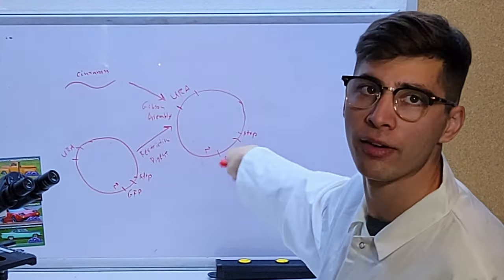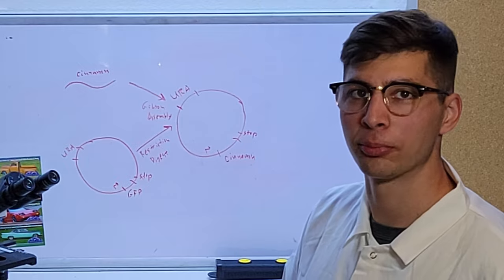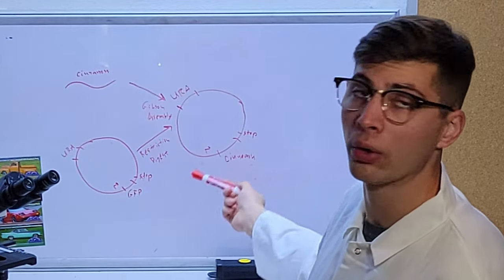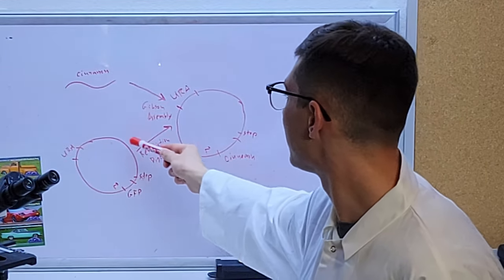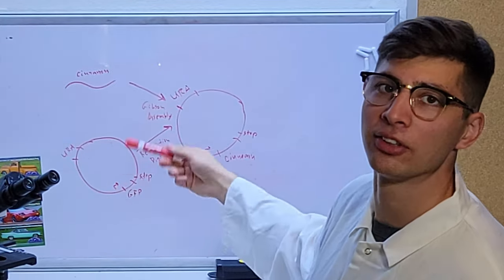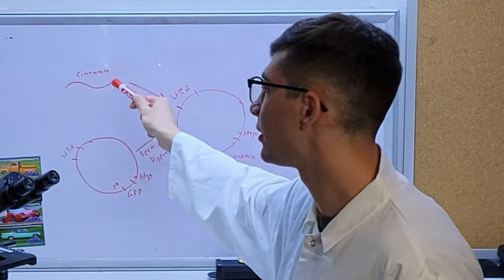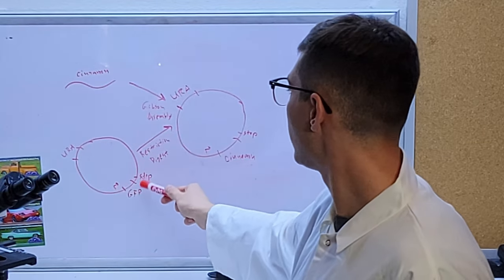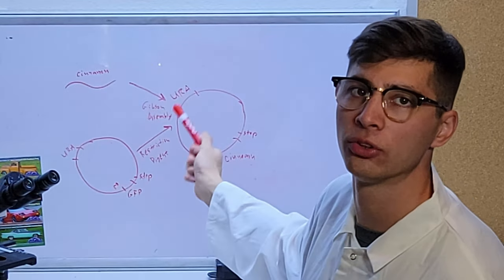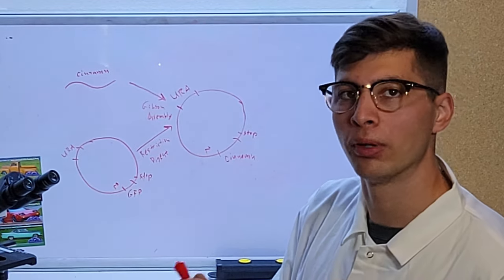On the other side, we should have our finished plasmid. We've only used two of the four tools that I mentioned previously. We could have used PCR to amplify the cinnamon gene from another organism, or to amplify the entire backbone of the plasmid excluding the GFP gene. We could have also used ligation — designed the cinnamon gene to have restriction sites on either end, made those cuts, and used ligation instead to assemble this plasmid. Personally, I think Gibson assembly is much easier and works much better most of the time.